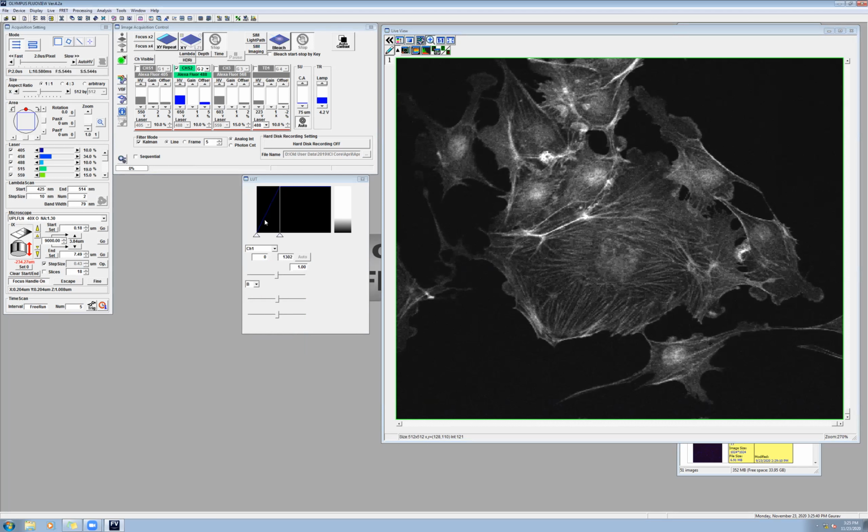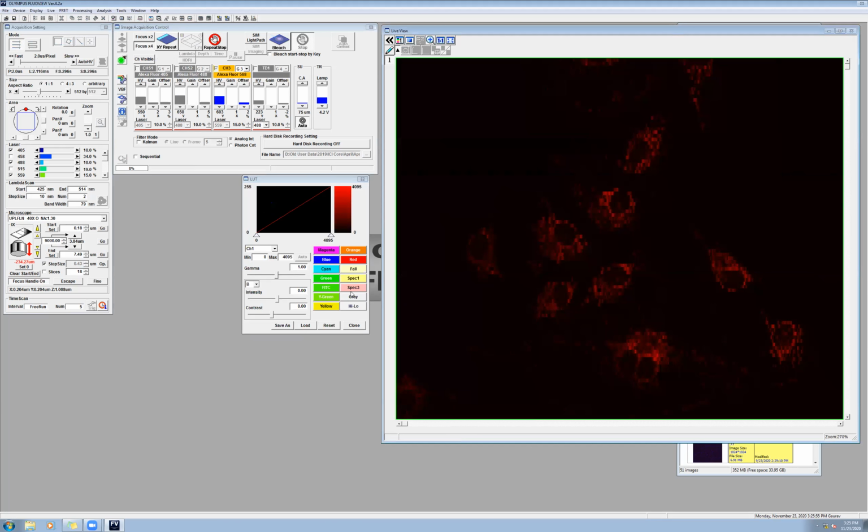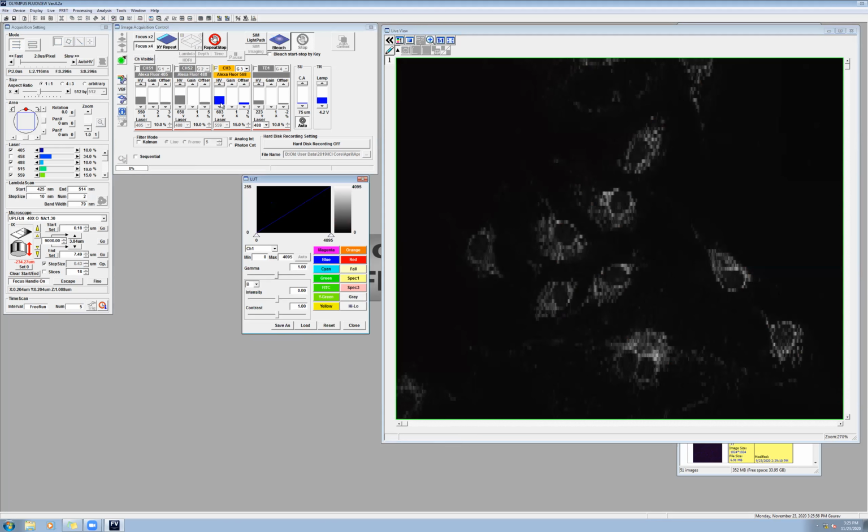I'm going to get the settings up and running for the third channel. So once I'm here, I'll do my third channel, which is the mitochondria signal. Again, I've set it to 603, and my laser power is pretty high, so I'll bring it down to 10.